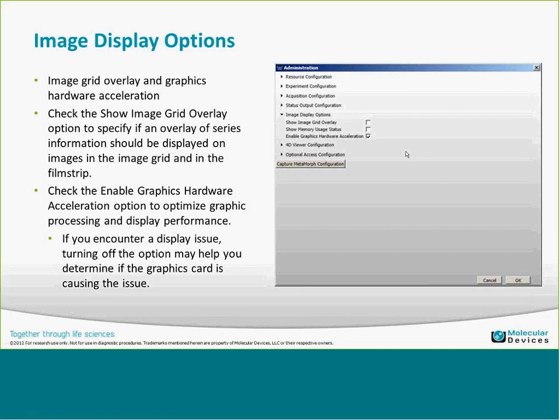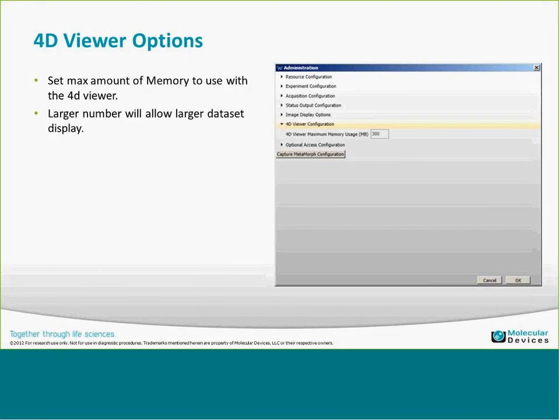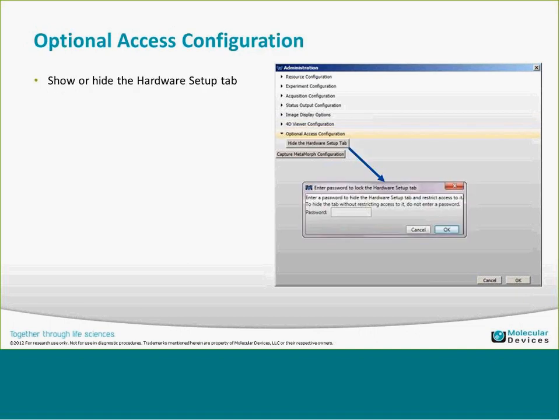The 4D viewer option is where you set the maximum memory usage — the default is 300 megabytes. I'd recommend changing this to at least 2 gigabytes or more, depending on how much RAM you have available, because you want a larger value when looking at larger datasets in the 4D viewer.